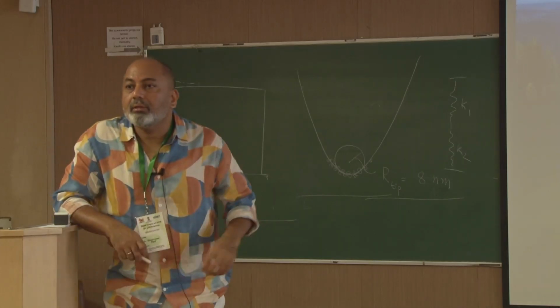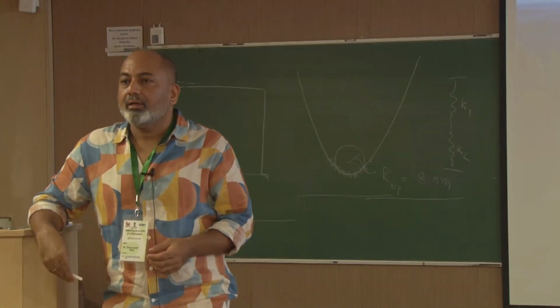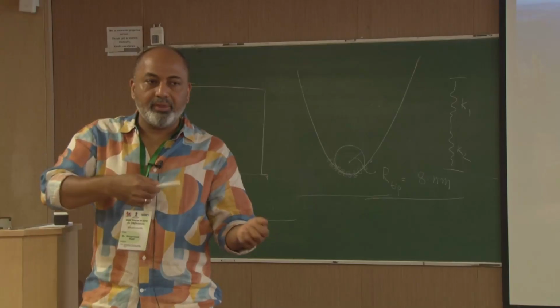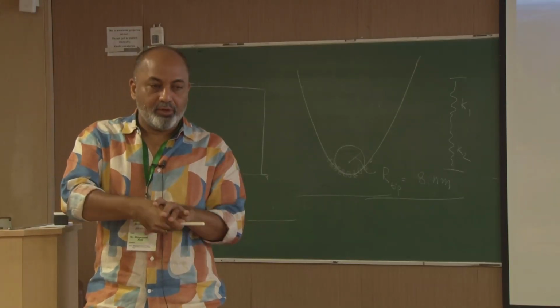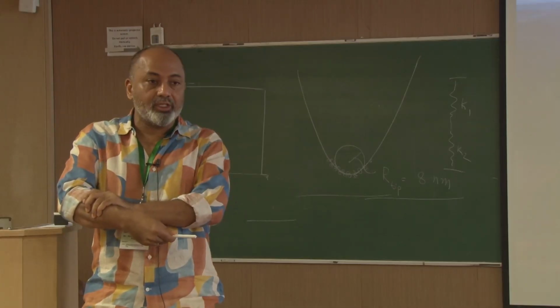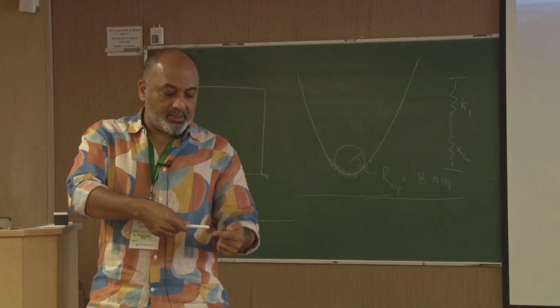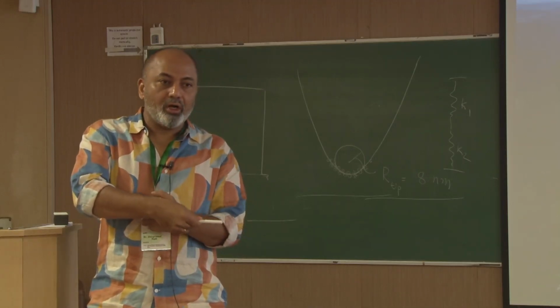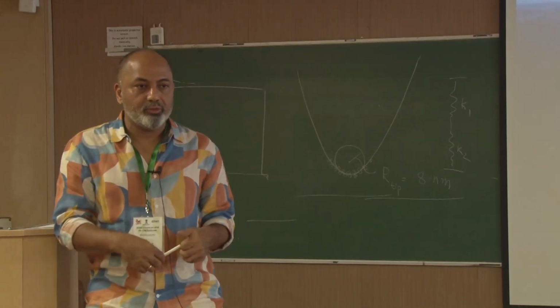One thing is that the other end of the cantilever is free. Yeah, the other end is free, of course. That is more important. That is the reason. That is free with the tip on it. So this is held with the chip at the back. The chip is held with a spring. We'll see that in the lab today. And then this guy is free with a tip there, and the whole block doesn't bend. Of course, it is too high in stiffness, and only this bends to measure force.